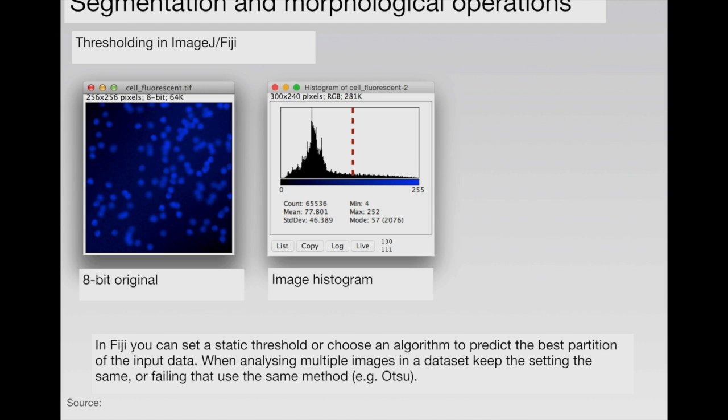But if you saw this, you'd generally think this was our cells, right? When you look at this image, you think that actually the most common pixel is from our cells rather than the background. Maybe I'm wrong, but actually this is our background and it's not black, but our eyes are quite bad at determining that. So a histogram is useful for inspecting our image.